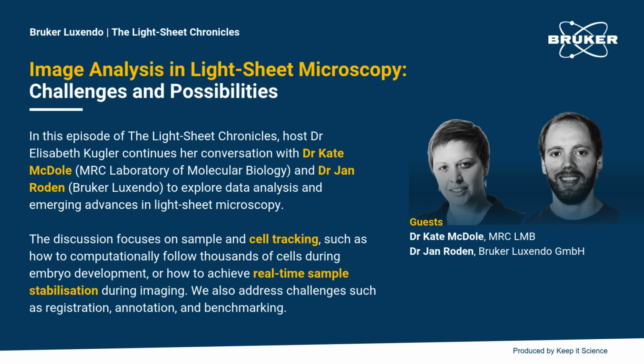I love that. Thank you so much for bringing all of that up, Kate. That's really, really interesting, especially the point about sparse data. You mentioned before that you do intersample registration and sometimes even mosaic labeling. So how do you approach it if there's too sparse data? Do you fall back on a manual registration with landmarks, or how do you approach it?